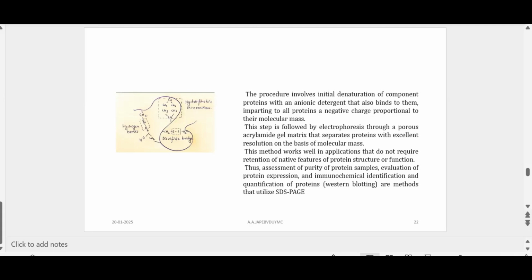Those proteins can be separated using the solvent system in addition to urea, so phenol, acetic acid, and water. So in a nutshell, whenever you have oligomeric proteins, you have to separate those polypeptide monomers and then run the electrophoresis so that you can reveal the true and complete nature of the molecule. Otherwise, even though there are so many polypeptides, a single band will be produced.